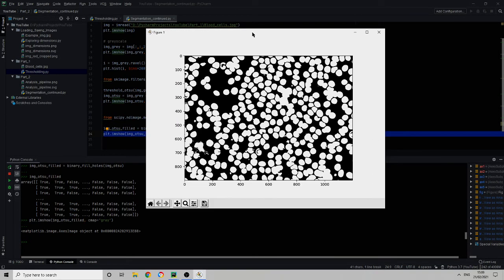But before we do that, there's a couple of other things with the image that we need to sort out before we start labeling the objects, which is we have a couple of cells where the boundary between them has disappeared or is just non-existent. And we have this kind of snowman shape. We got it here, got it here. Here we have, I don't know, a quadruple snowman. Here we have a kind of cross. We need to deal with that.